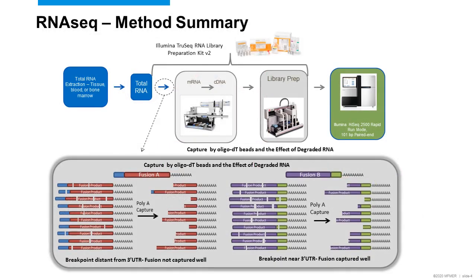The RNA-seq method, on the other hand, that was used for this study, used the Illumina TruSeq RNA library prep kit and leveraged a poly-A capture system to identify expressed fusions.